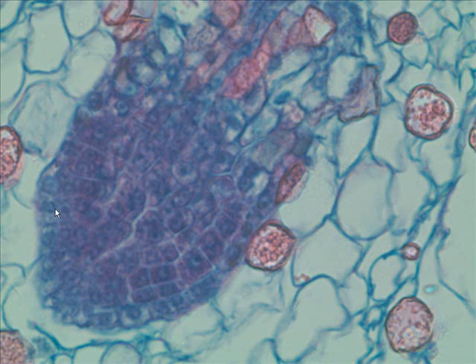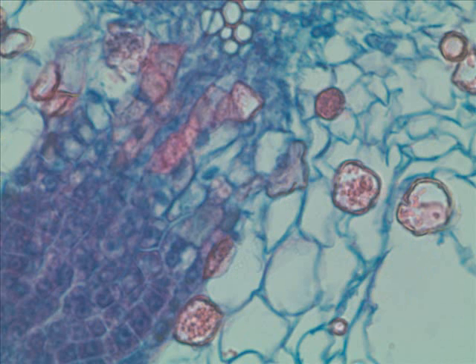What's this outside layer out here? The what? The root cap. What is this region right here? This is the apical meristem. And there you have it, ladies and gentlemen. I think that's it. Now one more.